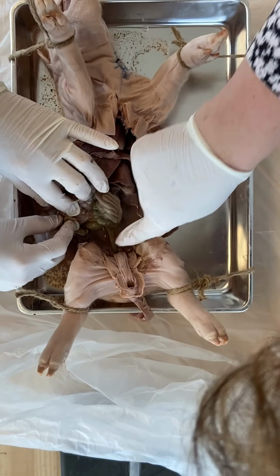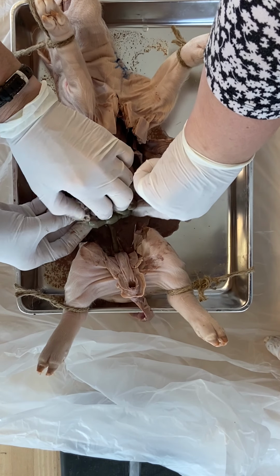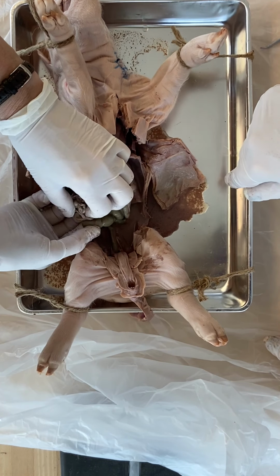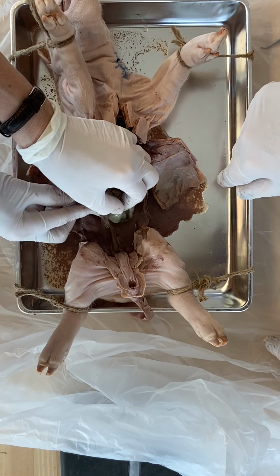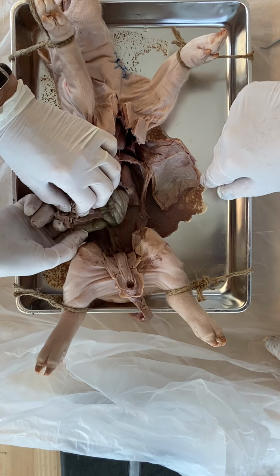I'm just trying to see where the small intestine joins. But this would look as though it joins further down, doesn't it? Yeah, this looks like it's further along. See, I thought this was it, but when I actually pull it out, it's just a membrane holding that piece there. But that's got to be it, because where else would it be joining?